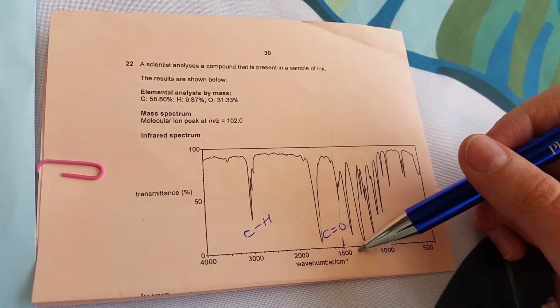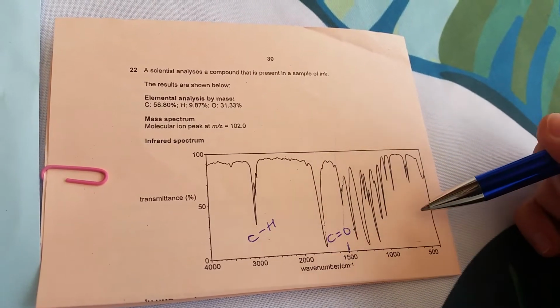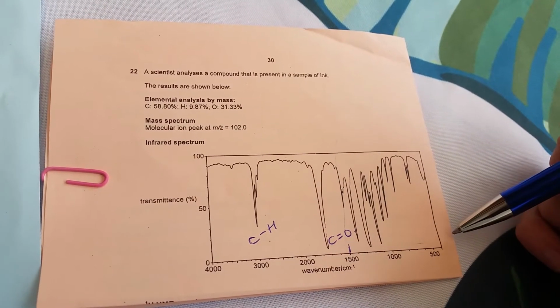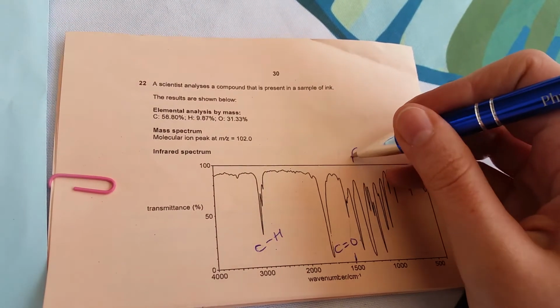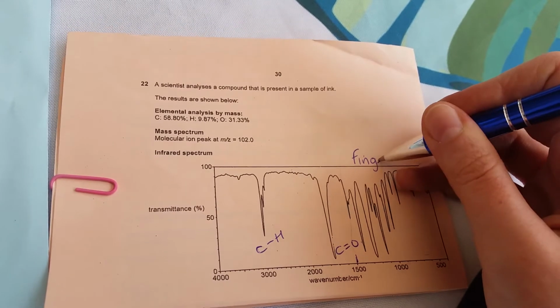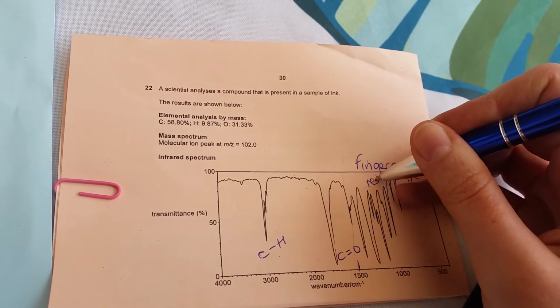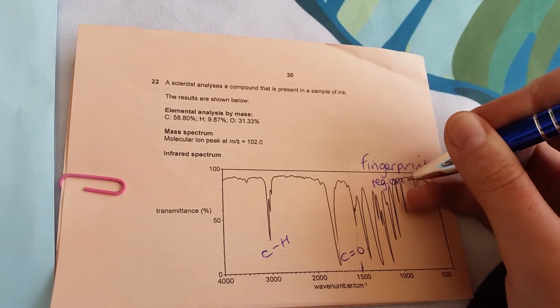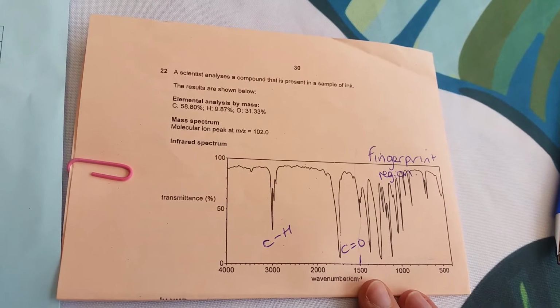However, below this wave number, the peaks all merge together and we cannot identify peaks in this region. So do not try to look for any of these peaks and match them up using your data table. So I'm just going to annotate that fingerprint region.